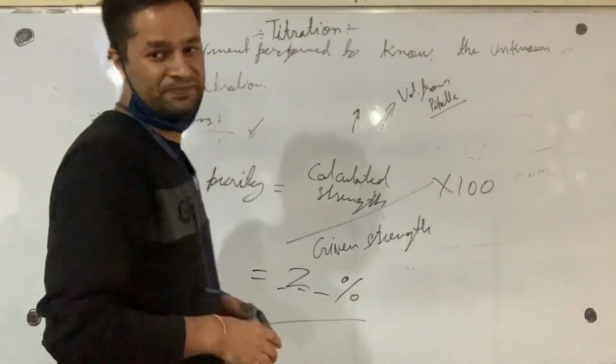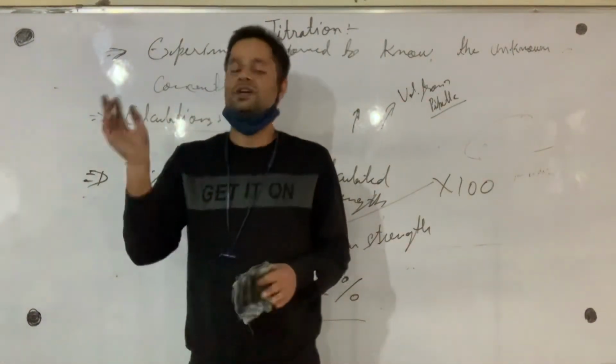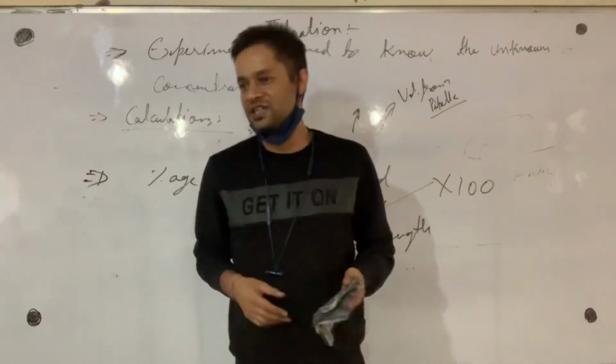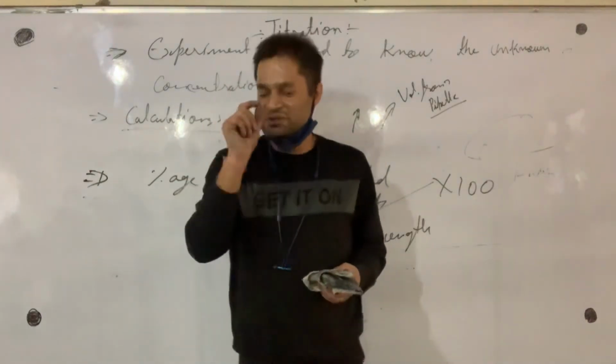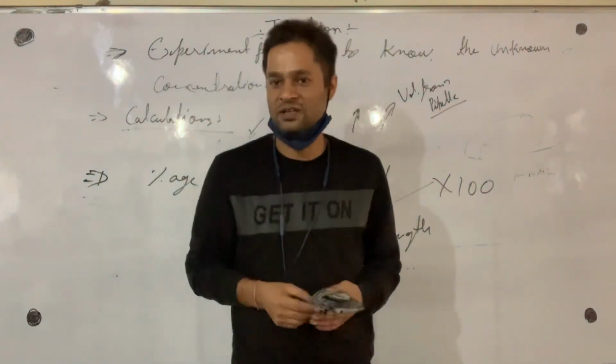So are you ready? Now we will perform the practical. I know the concentration of all solutions, but you should calculate the accurate concentration. Okay? Let's start now.